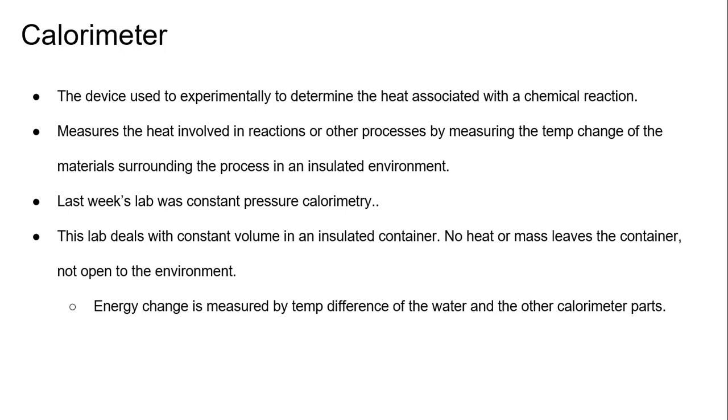This week, if you had been in the classroom, it would be an isolated, think of it like a thermos, a really very insulated box where a reaction would occur, not open to the environment. This measures the heat involved in reactions or other processes by measuring the temp change. So we can't see what's going on inside because it's sealed, but we can pay attention to the temperature change of what was before and what occurred during and after.